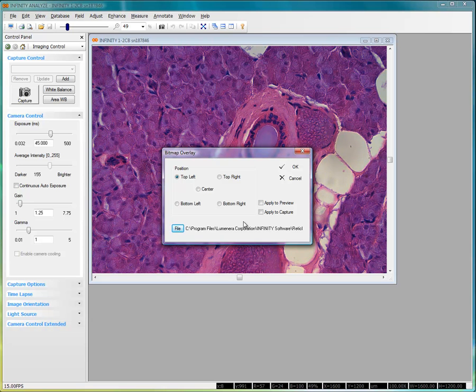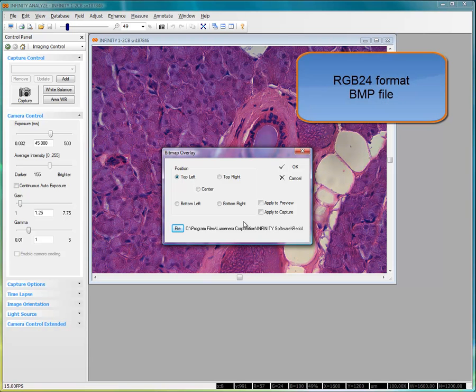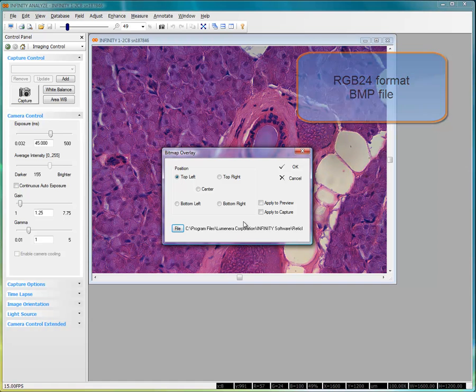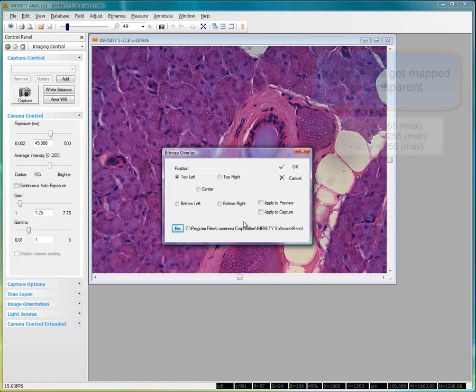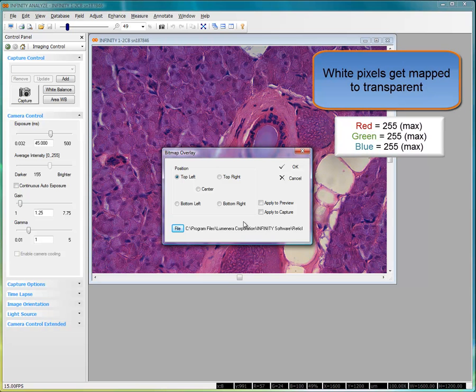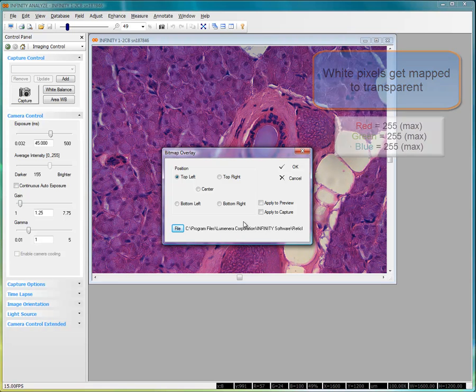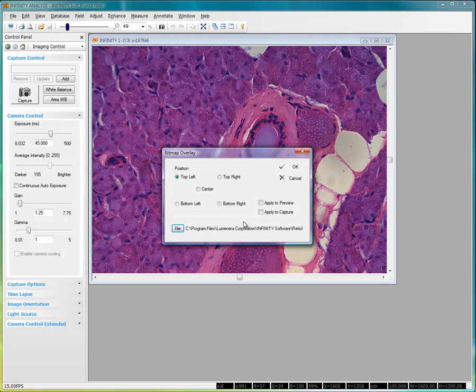So what do we need for this bitmap overlay to work? The file must be a true bitmap in the RGB24 color format. All pixels in the bitmap that are colored white, for example red set to maximum 255, green 255, blue 255, these pixels will be mapped as transparent, while all other pixels in the image will be displayed in their native color.